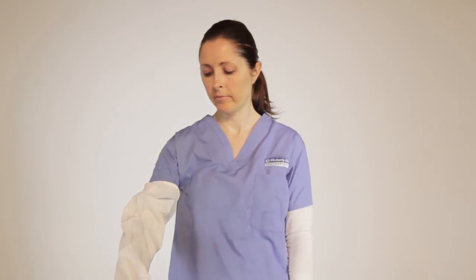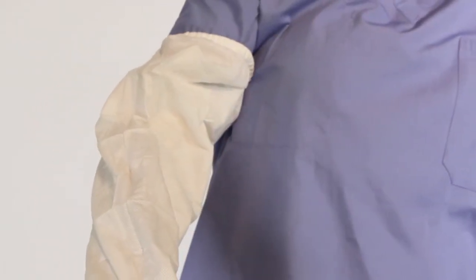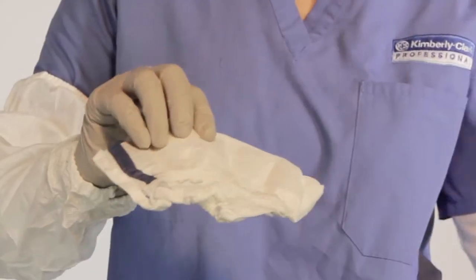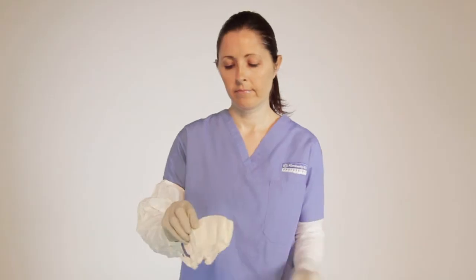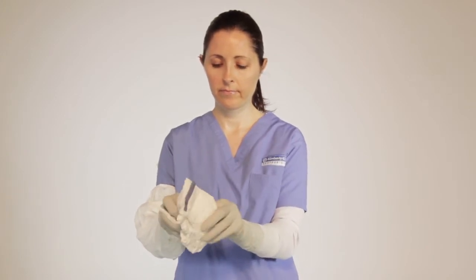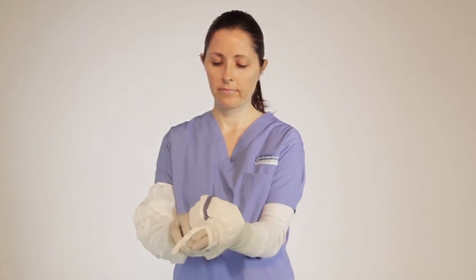Proceed by donning the second sleeve. Reach in and pull out the second sterile sleeve at the cuff. Locate the opening, which is the larger side of the sleeve, and stick your hand through with the thumb loop positioned upward.